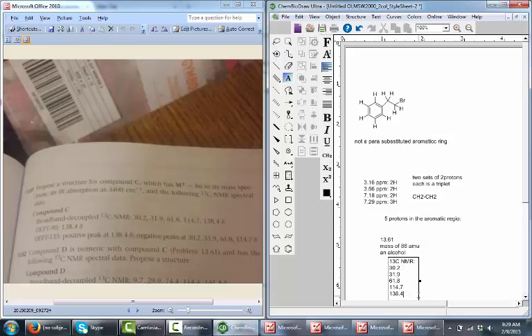I can see these two, the 138 and the 114, look like they're alkenes. This one looks like an alkane near an OH. This is a regular alkane, and this one will also be a regular alkane. So that's the first information I can get from here.